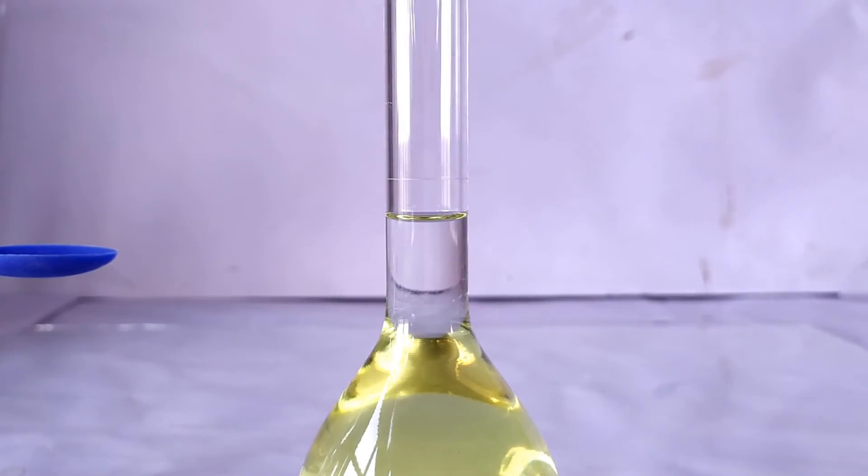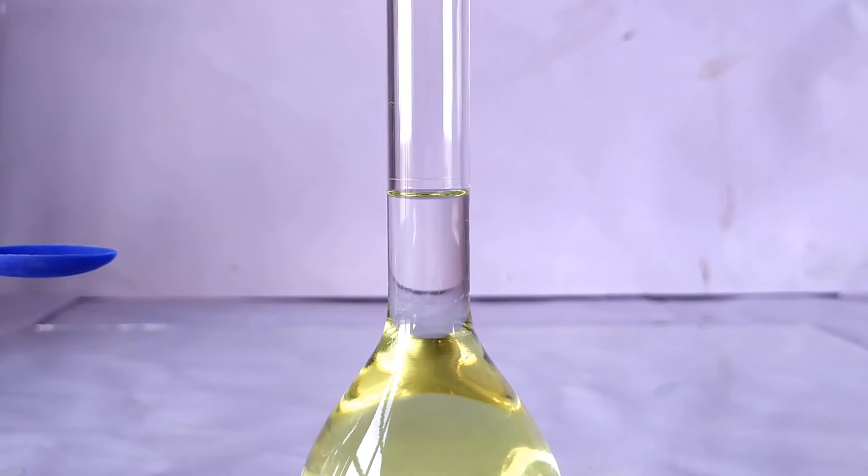Now make up the volume in the flask to exactly 100 ml using the same solvent used to dissolve the ninhydrin.